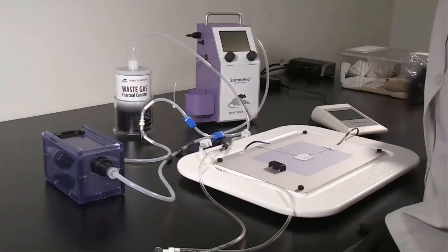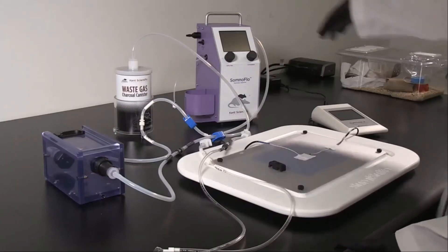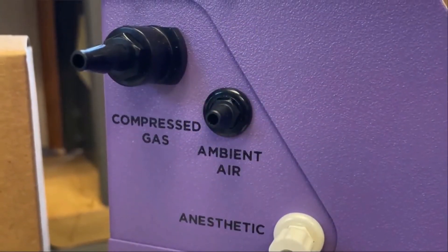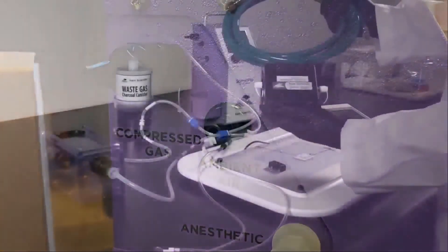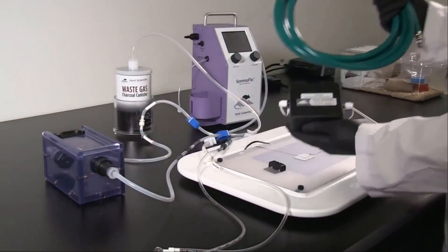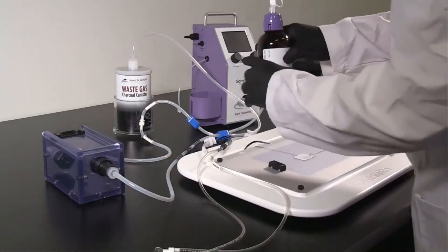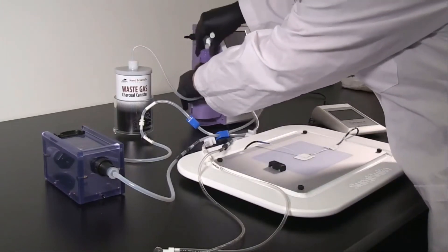Here is a short video showing how easily the SomnoFlow is set up and how it can be used in your laboratory. The SomnoFlow can deliver anesthesia without the need for compressed gas. If you're using ambient air from the system's internal pump, leave the air inlet open. If you wish to use a compressed gas source, use the compressed gas assembly to connect a pressure-regulated gas source to the SomnoFlow's compressed gas port — the inlet pressure should not exceed 15 PSI. Connect the included bottle top adapter to a bottle of anesthetic, then connect the delivery tubing to the bottle top adapter and place the anesthetic bottle into the holder.